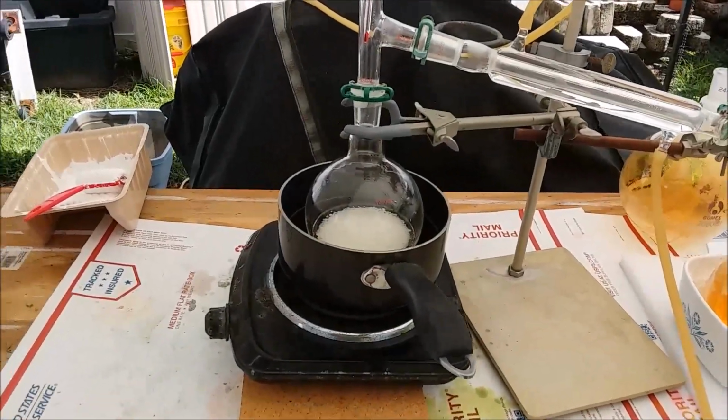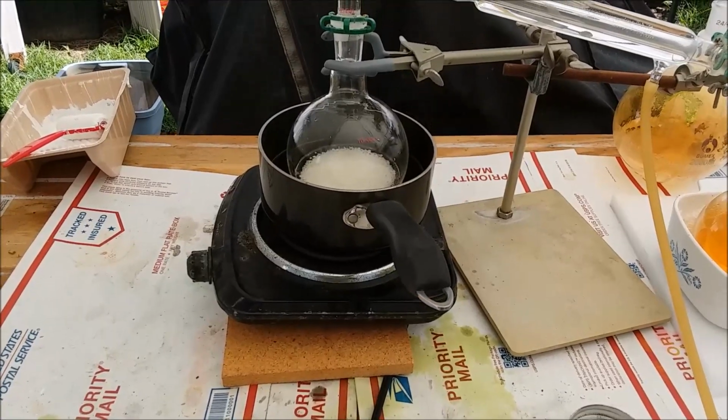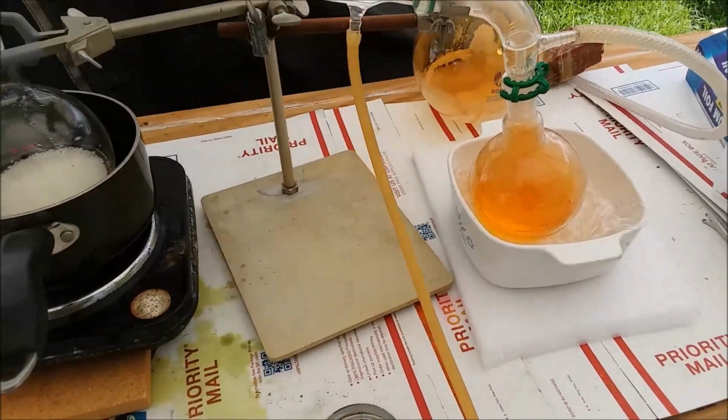Okay, I've got the 1 liter flask attached. Things are starting to heat up again. The oil never really got cold, so I'm expecting this reaction to take off pretty quickly. I'm trying something a little different this time.